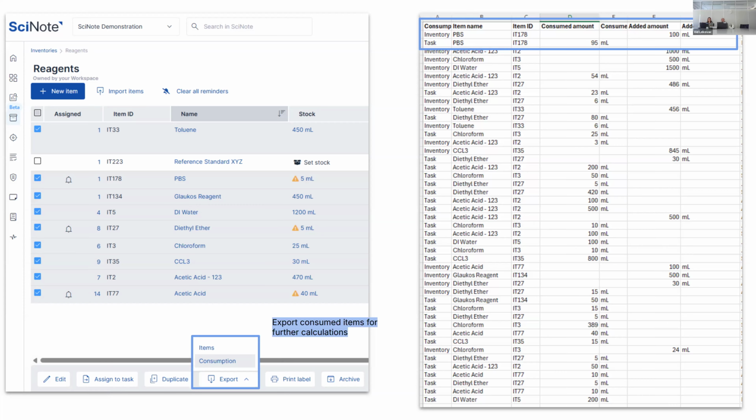If not, then obviously it doesn't matter. If you have the best technology in the world, it's not going to help you if you do not log it into the system, and if, when that is moved or changed, it's not logged again. So yeah, just wanted to mention that again. Makes sense. Okay, cool. Let's move to the next slide.